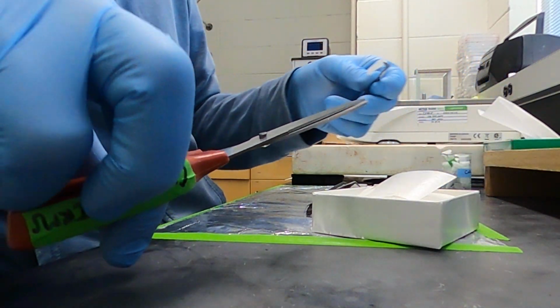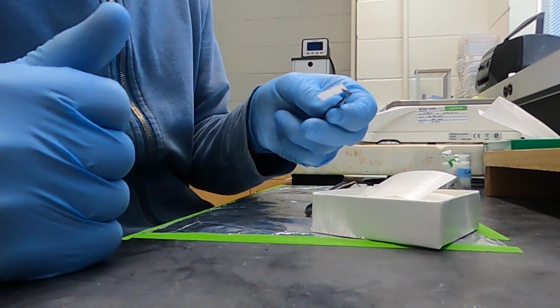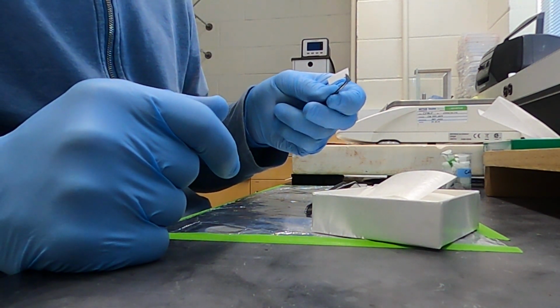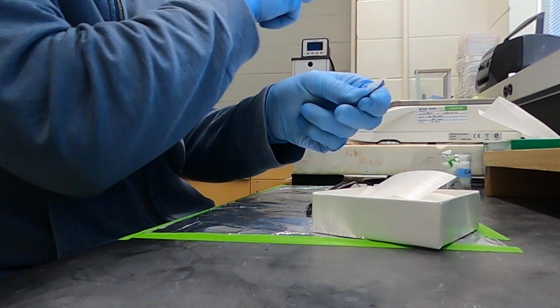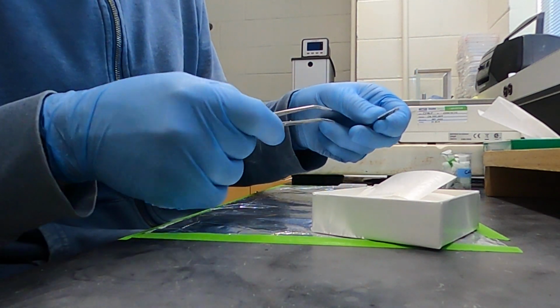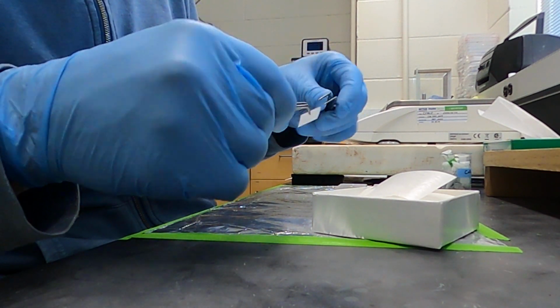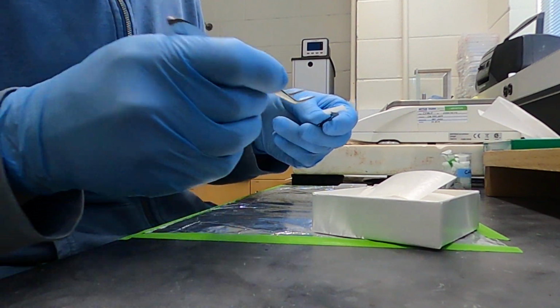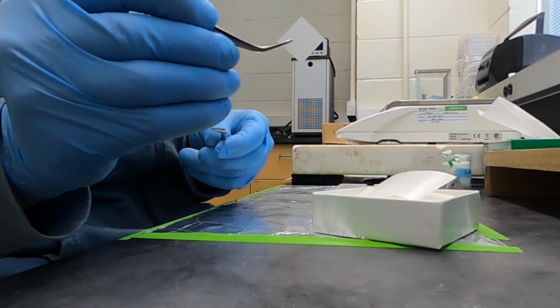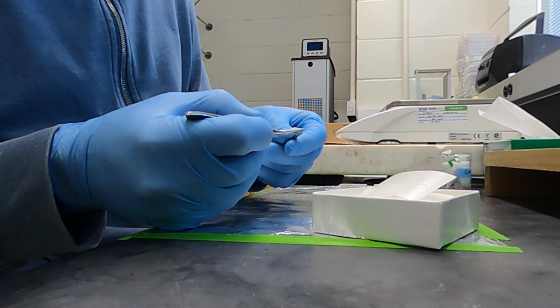And I try to not go, well, to me that's the best size. Smaller, it becomes really difficult to manipulate, at least for me. Bigger, it will make the weight on the scale move a lot more than it should. I don't know exactly why. Maybe it carries more static, maybe it's more sensitive to whatever airflow is in there. But I find a little square like this, it's just fine. So the way I do it, but everybody's got his own preference.